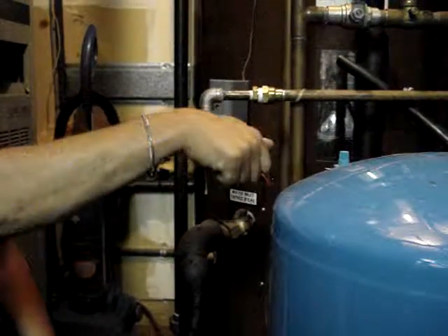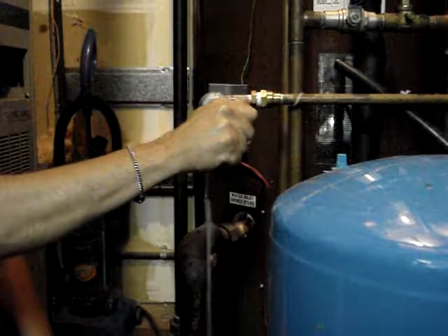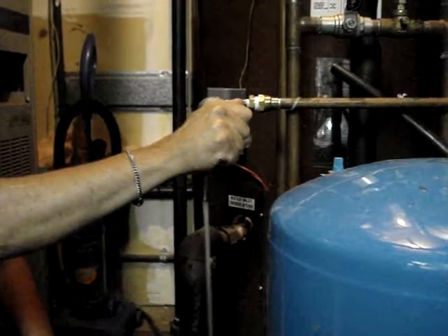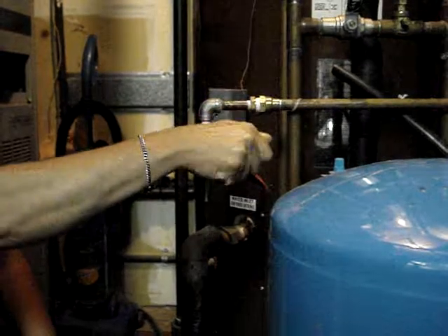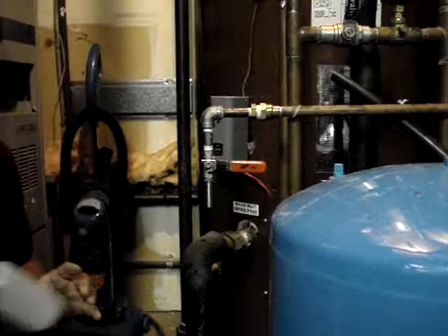Let the water flow until you get a representative water sample through the line. Now that may take three or four minutes, five minutes, depending on the length.